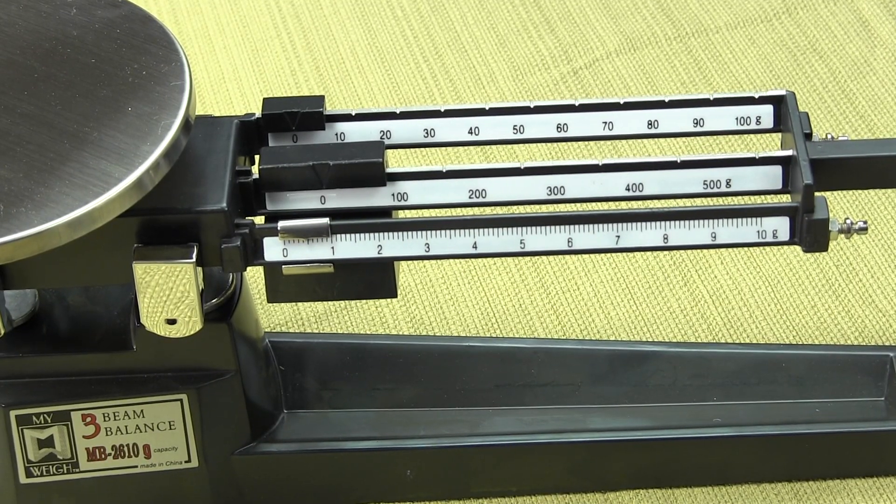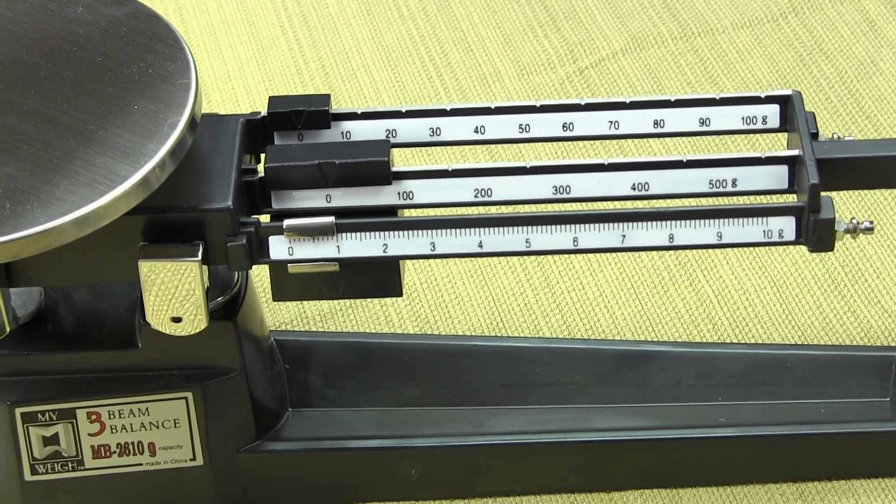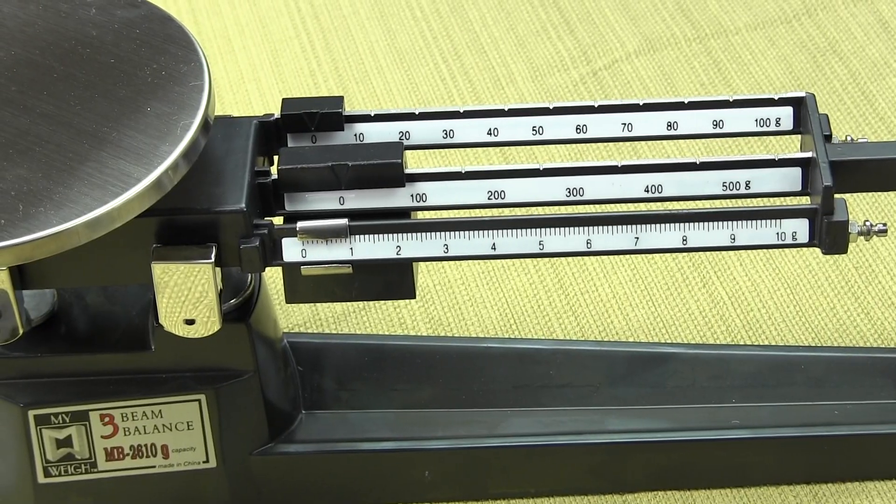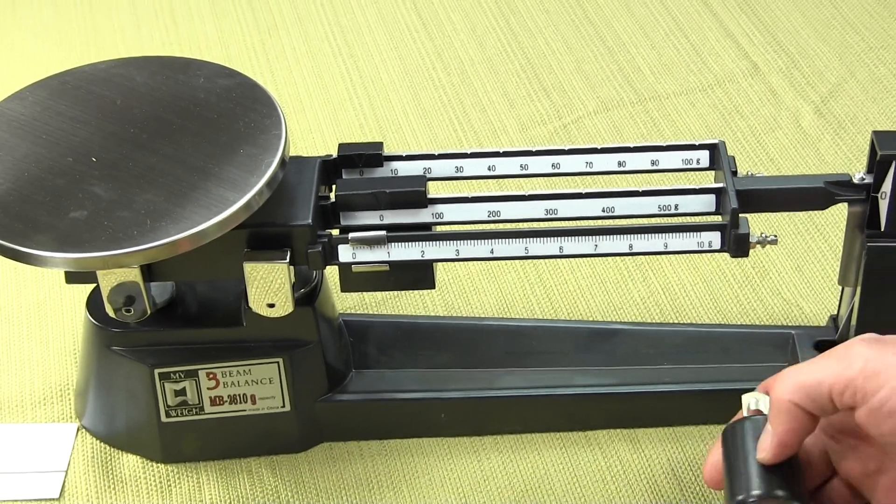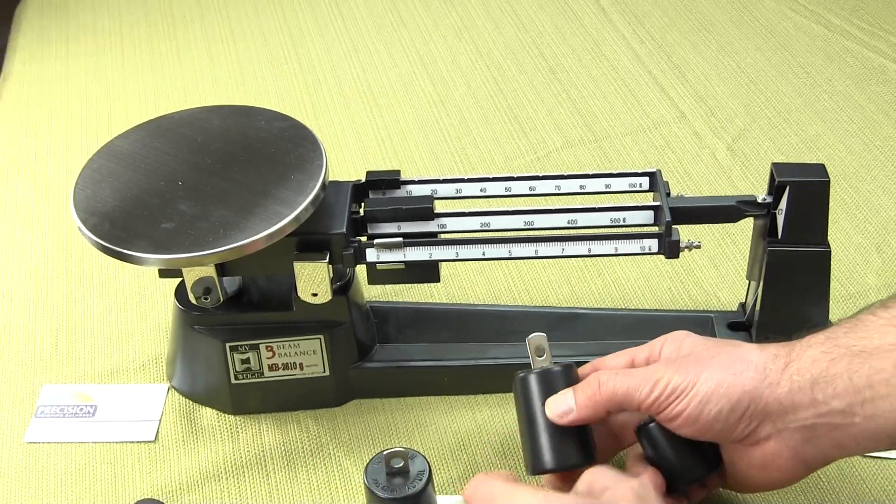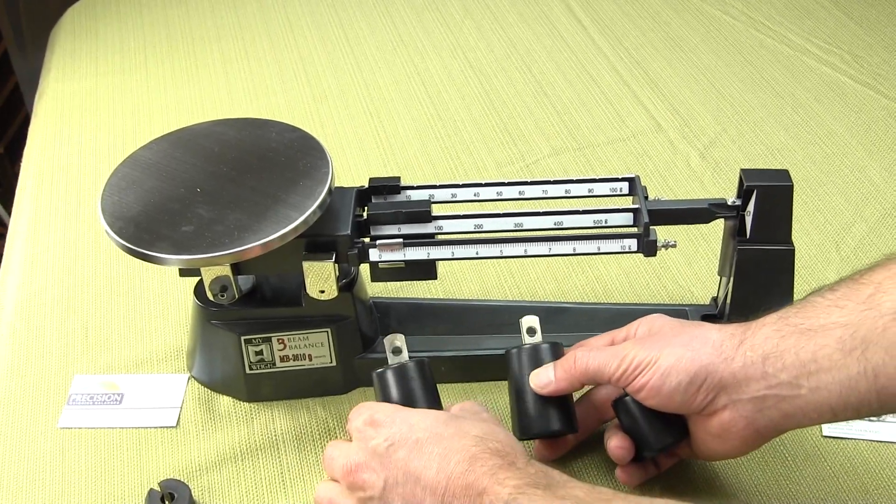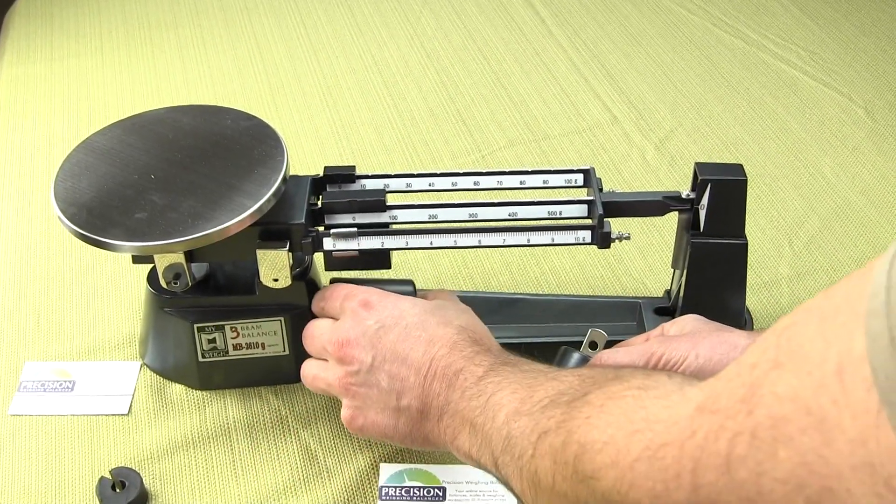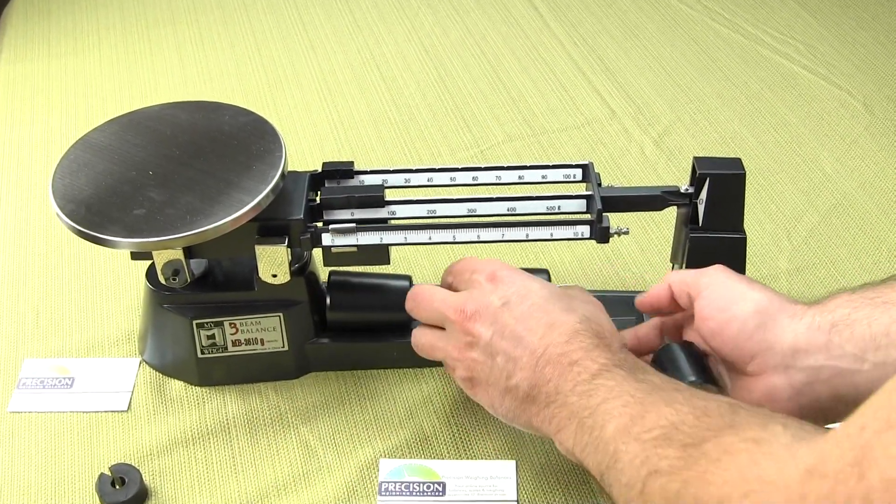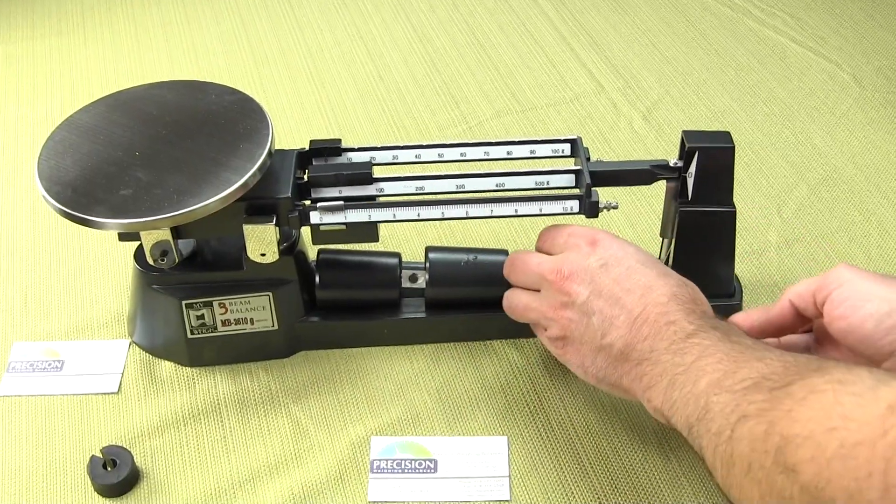The base is a cast metal base. The three beam balance, unlike competitive brands on the market, comes standard with three attachment weights. These attachment weights, one would store them right underneath here, right in this little tray.